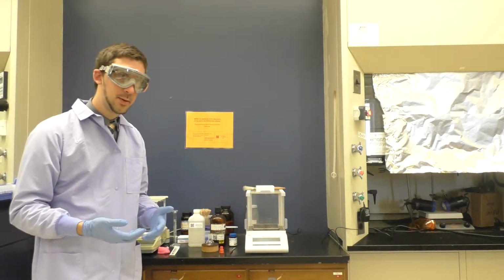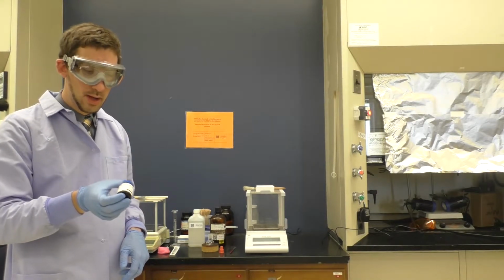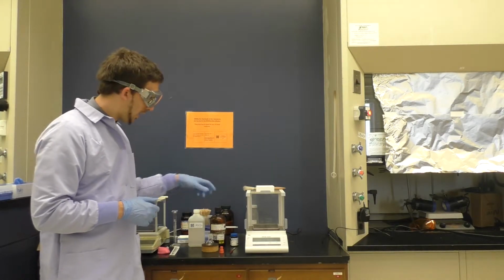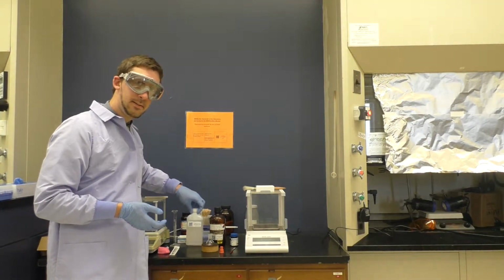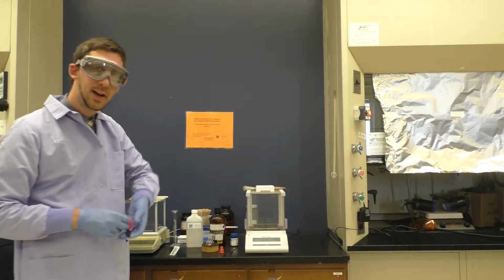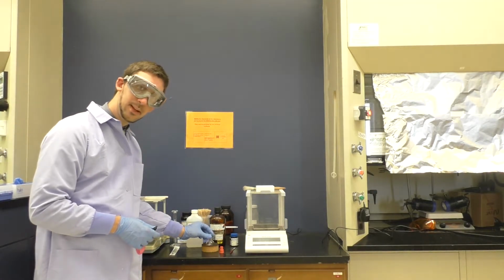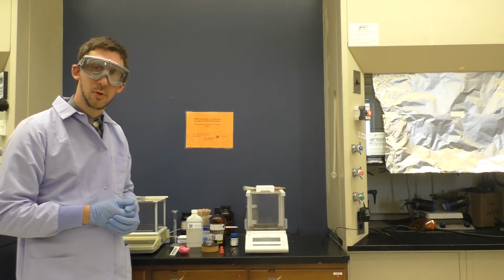And so here we'll first begin by weighing out approximately 10 milligrams of the palladium on carbon, the 10% palladium on carbon. We will then add that into the round bottom flask and move into the hood. And then we'll add 100 microliters of ethyl cinnamate, 5 milliliters of ethyl alcohol. And then from there, we'll need to add the active hydrogen source, which is just H2 gas. So I have a balloon here. I'll go fill that with hydrogen gas and then stick that down into the headspace of the round bottom flask. And then get the solution stirring so that it can perform the hydrogenation.